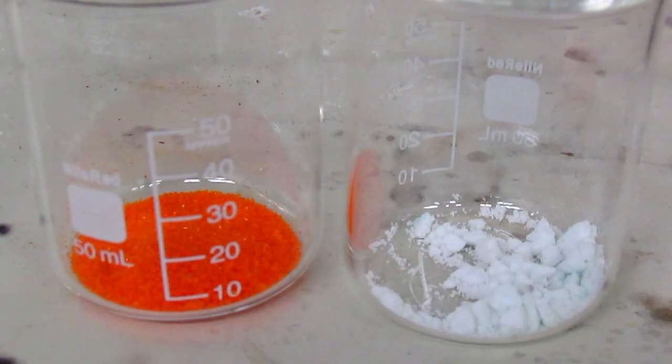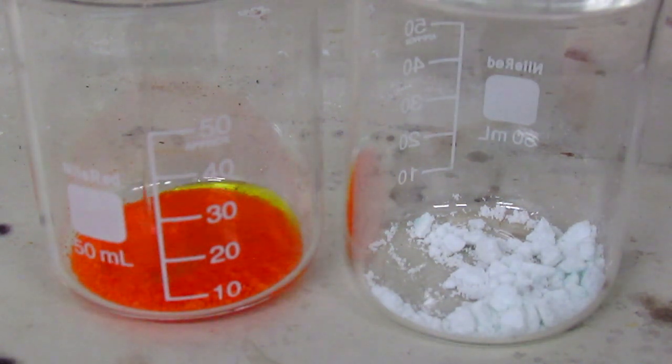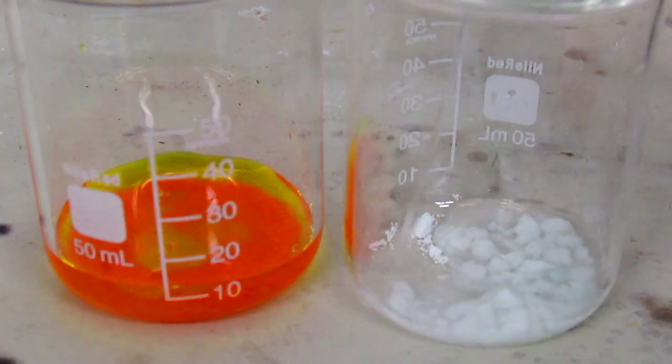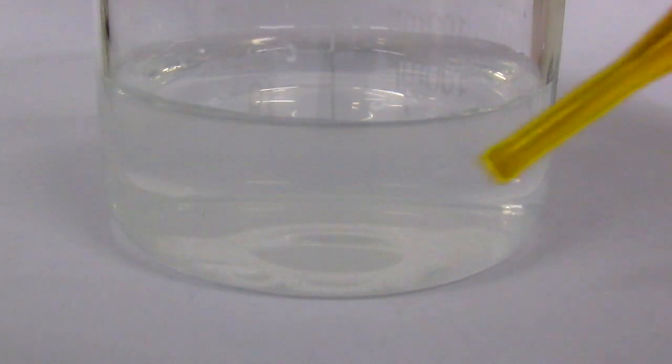Now I'm going to scale it up a bit. I'm using 2.2 grams of potassium dichromate and 2.5 grams of silver nitrate. I'm just going to get these dissolved. Now I'm going to add the dichromate solution drop wise with a pipette.